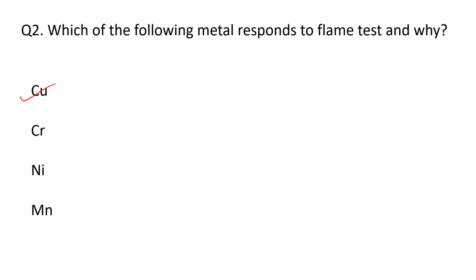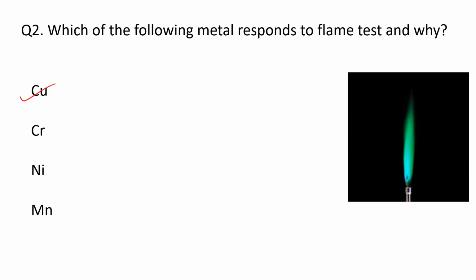But for copper chloride, in the flame test we take the concentrated hydrochloric acid form. Copper chlorides are uniquely volatile. I'll show you the color of this copper flame.